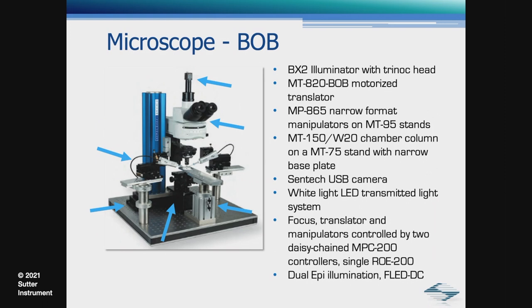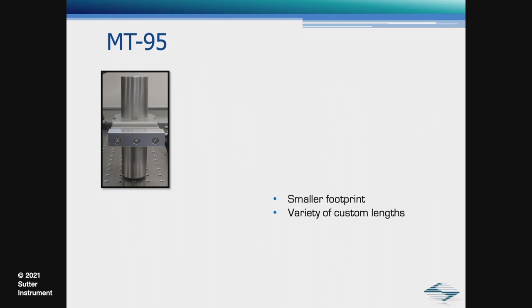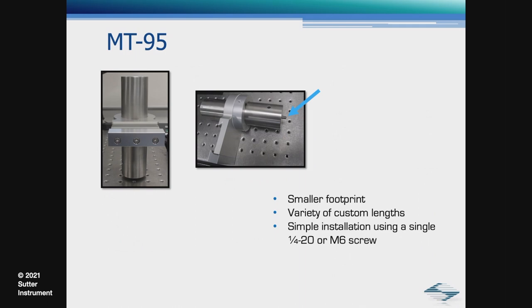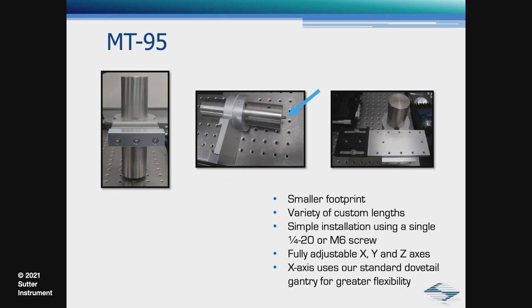In this configuration, we used our newest MT95 stands. They are different than our classic stands, but provide the same stable support in a smaller footprint. A variety of custom lengths are available, simple installation using a single quarter-twenty or M6 screw, which directly mounts into the table, fully adjustable X, Y, and Z axis. The X axis uses our standard dovetail gantry for greater flexibility.